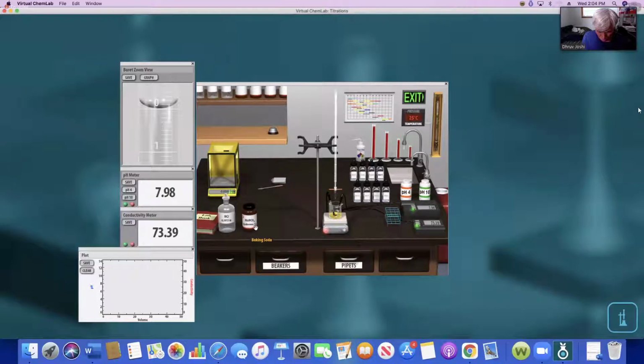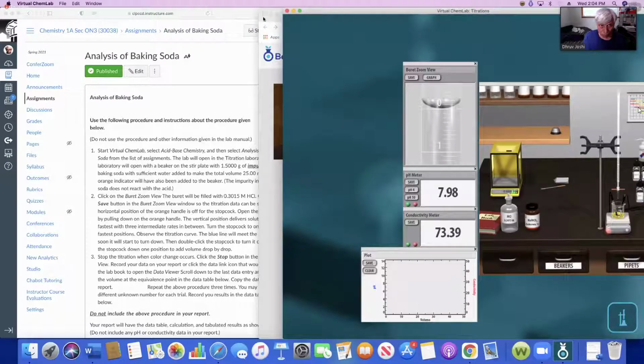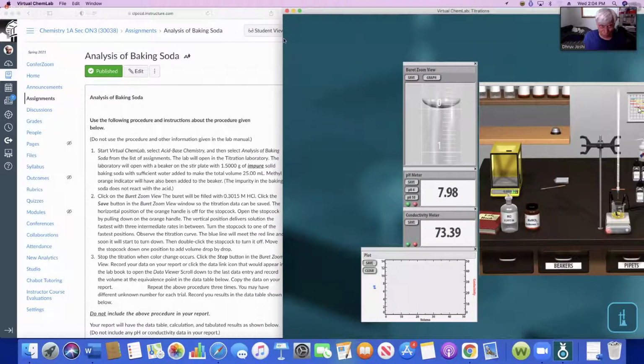NaHCO3, unknown number 13. So that's what we need to write down. Everybody has to have that unknown, otherwise I cannot do much with your stuff. I cannot tell you how good you are. All right. So we need to read that. So let's go. Start virtual lab.